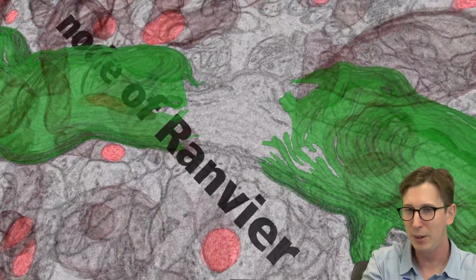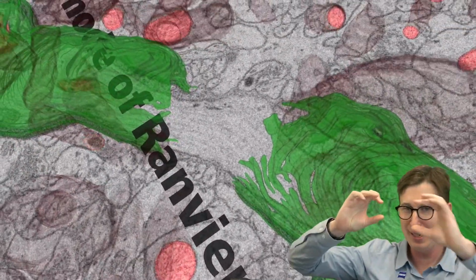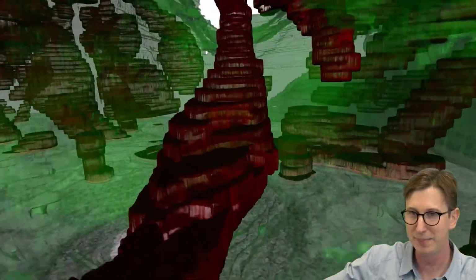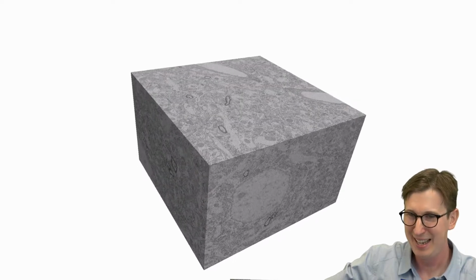There's a node where you have one myelin sheath end and the next one begins. This is a very fine structure within the cell, and malfunctions of those are related to several diseases of the brain. We could even fly inside a single axon and fly out of it.